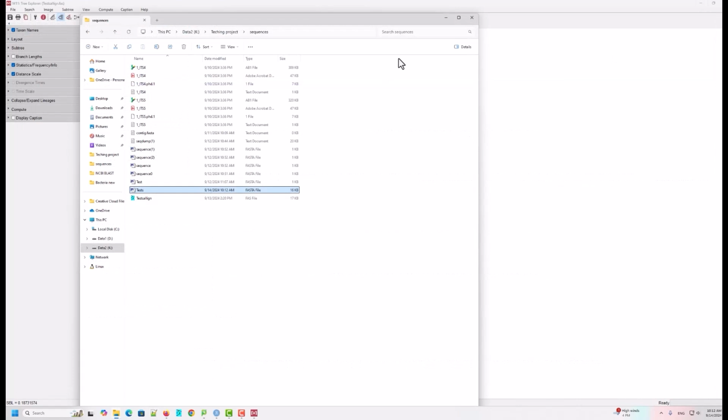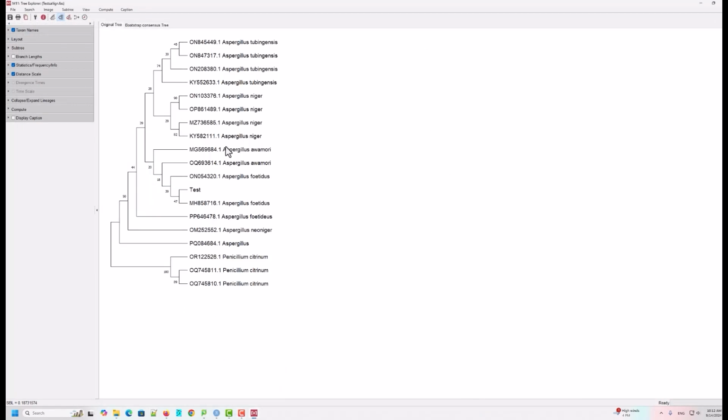When you open this file with Notepad, these are those names. Here you can just click and delete the name. You need to delete all these names, and then save this. After that you have to go to the alignment, and save the file in the alignment like we discussed in the previous class, and then import that into the MEGA software. I think then there will be no need for trimming in the MEGA software.